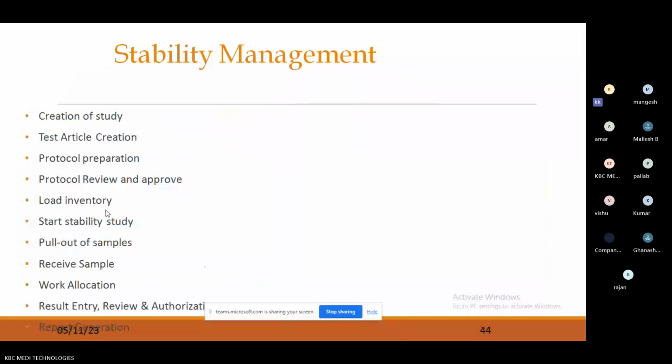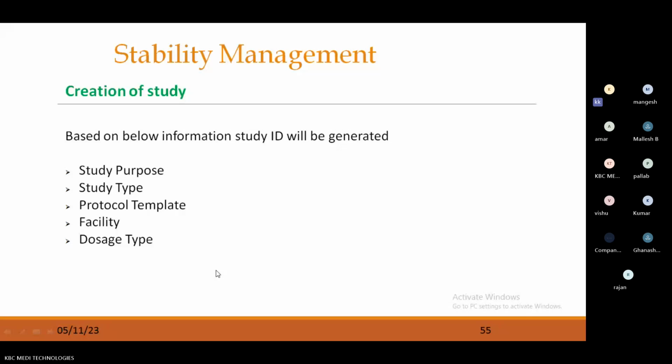The way I have communicated here, I am giving some examples: study creation, test article, protocol preparation, protocol review and approval, loading inventory, start study, pull out of samples, sample review, sample receiving, work allocation, results entry, review, authorization, report generation.